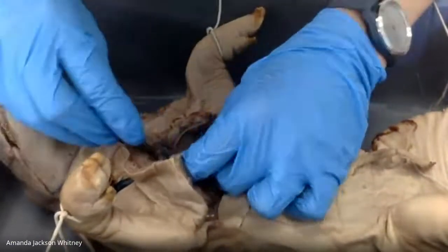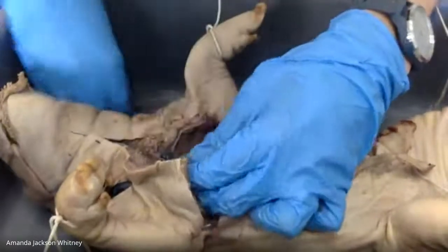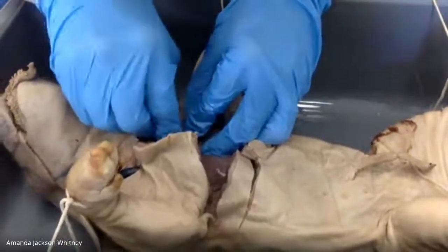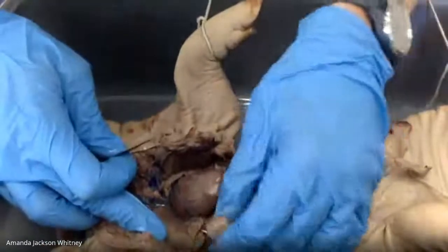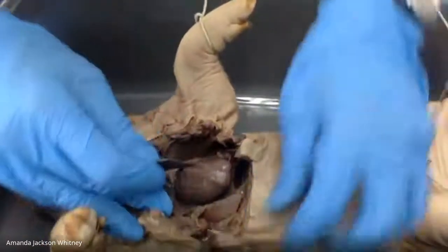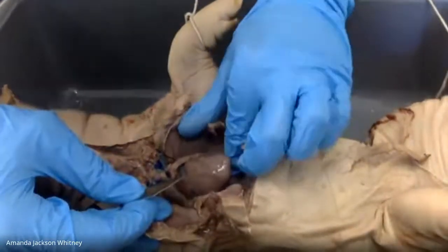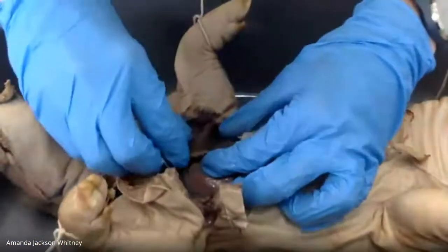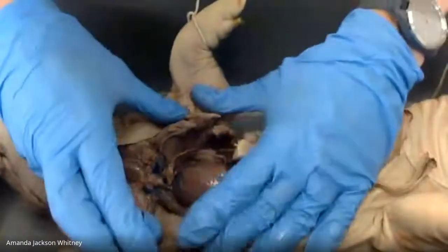Okay. Trying to preserve some of our blood vessels. Louie's got a significant amount of tissue in here for some reason. Because that's not normal. Louie's not abnormal. Okay, there we go. Put some of this loose. All right, we can start to kind of see in here these different vessels and the lung tissue as well. And I'm gonna move my fingers in just a second so you guys can see more.